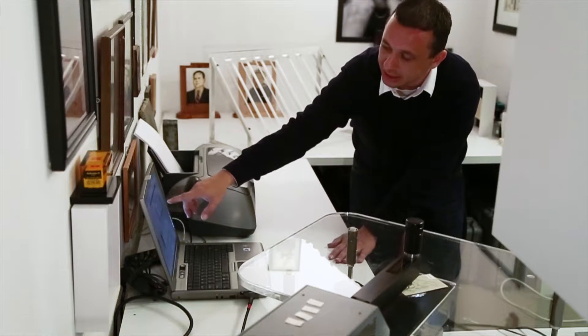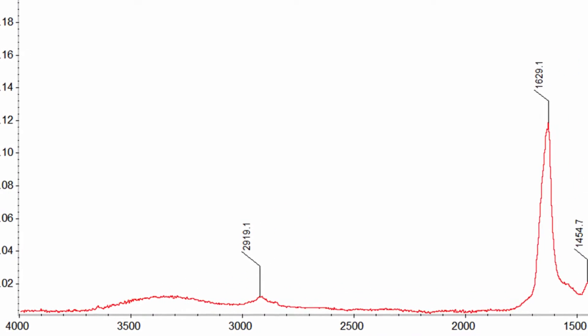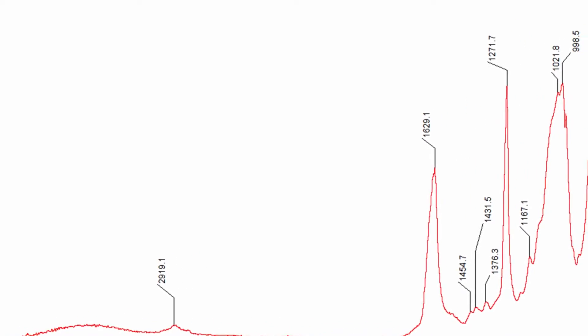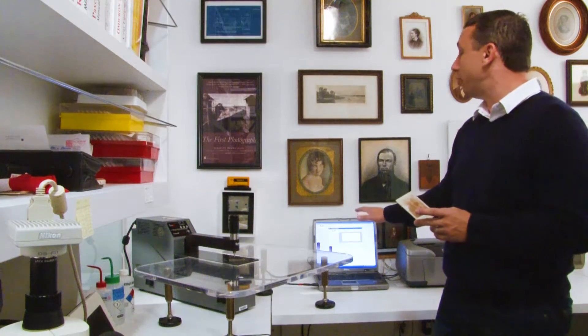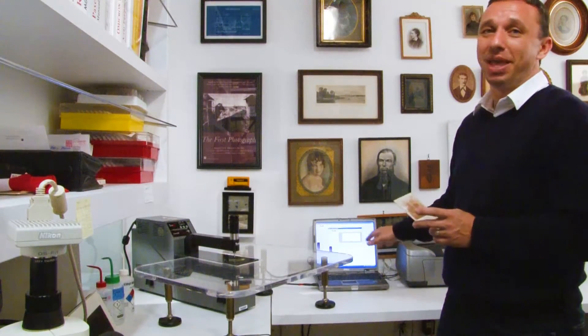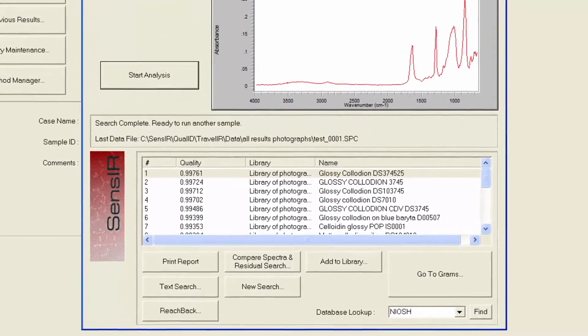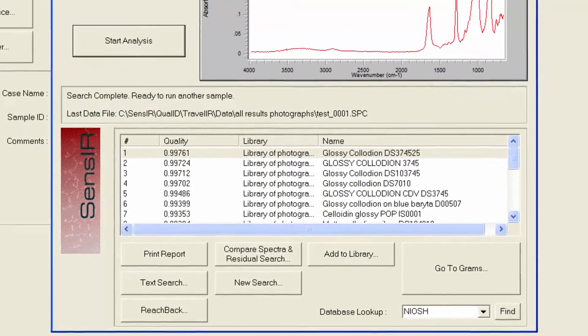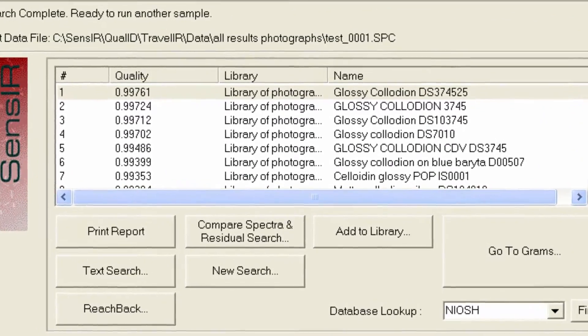You can quickly see the spectrum of your sample here. We're actually looking for chemicals, not individual elements. The instrument doesn't come already capable of doing this — it was a long time in the making, building up a library of photographic materials that created a now up to 7,000 photograph database that it searches each result against.